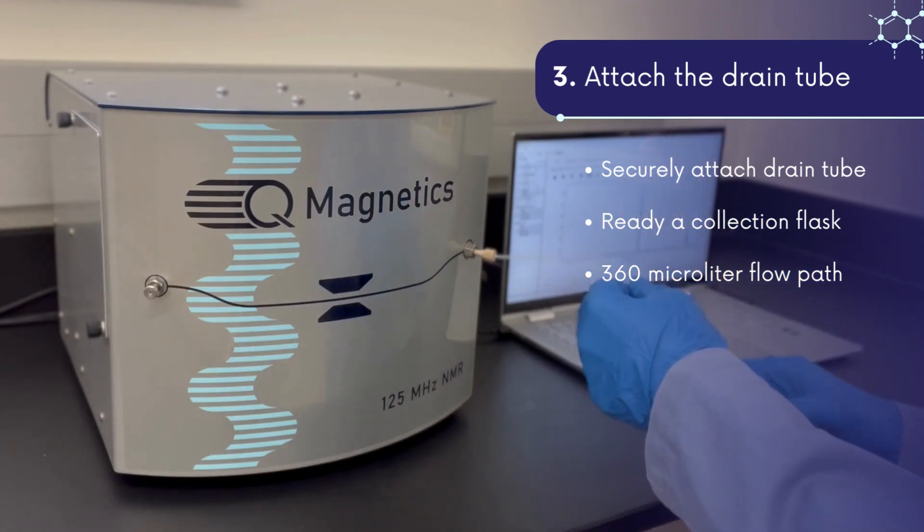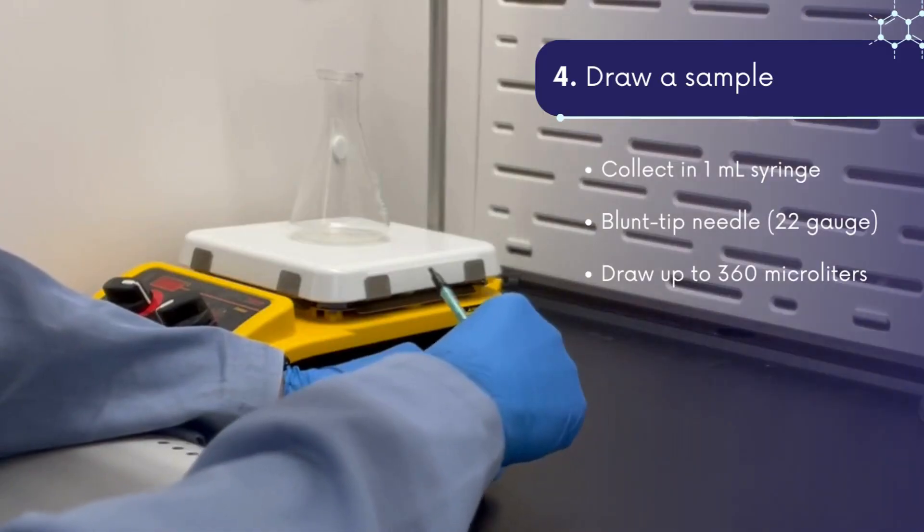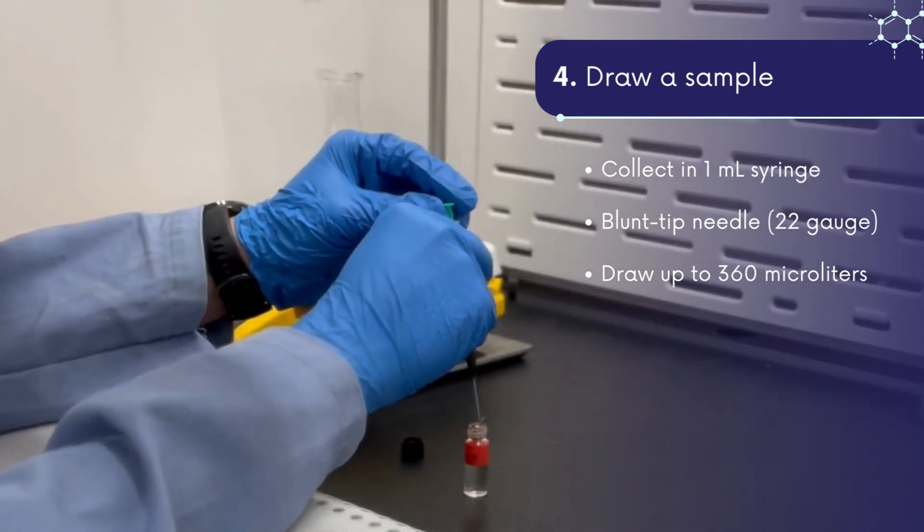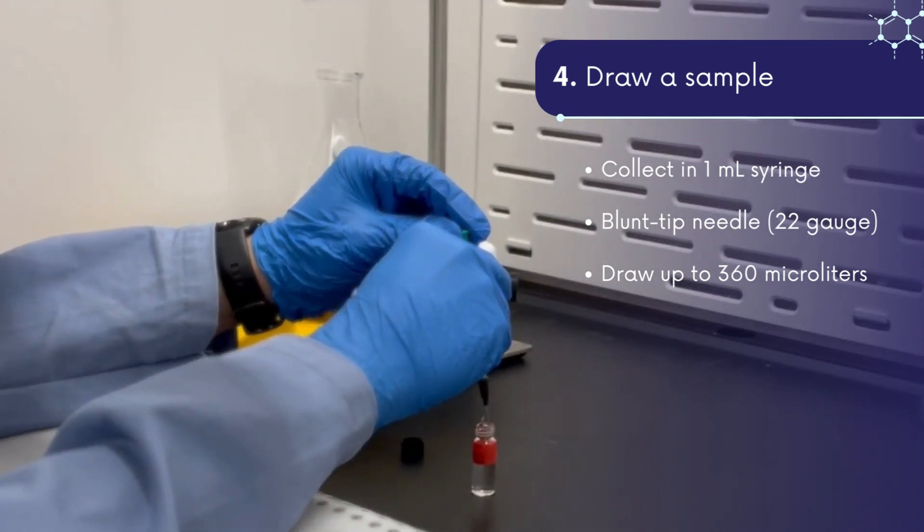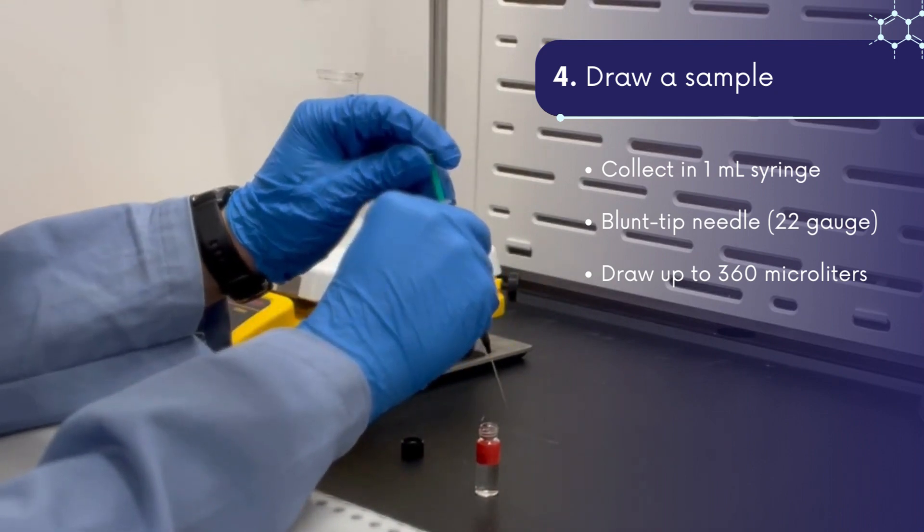The entire volume of the flow path inside the instrument is 360 microliters. With a 1 mil syringe and a blunt tip needle, we can immediately draw our sample. Here I am drawing up at least 360 microliters into the syringe, although much smaller volumes can be used by positioning the sample in the center of the flow path.